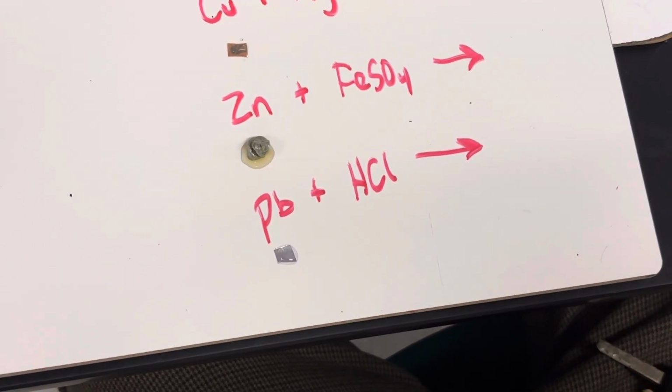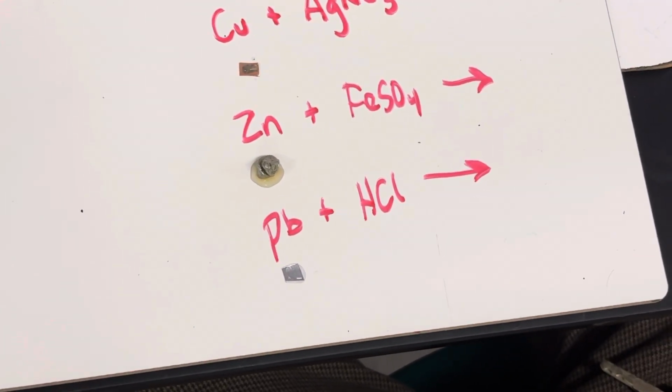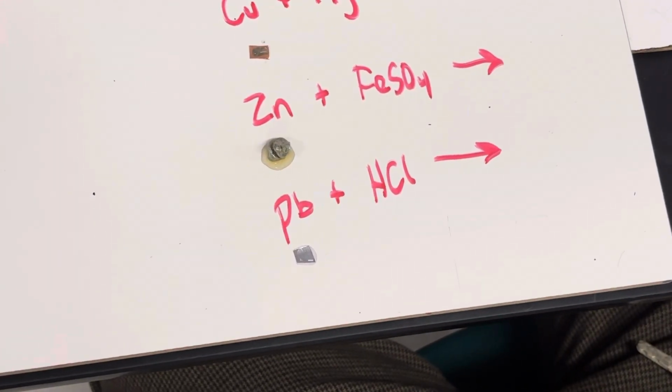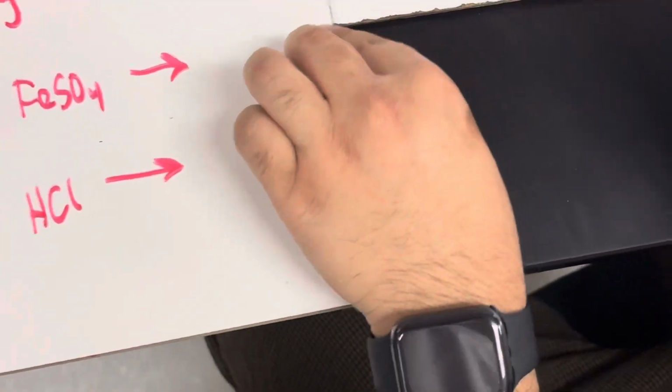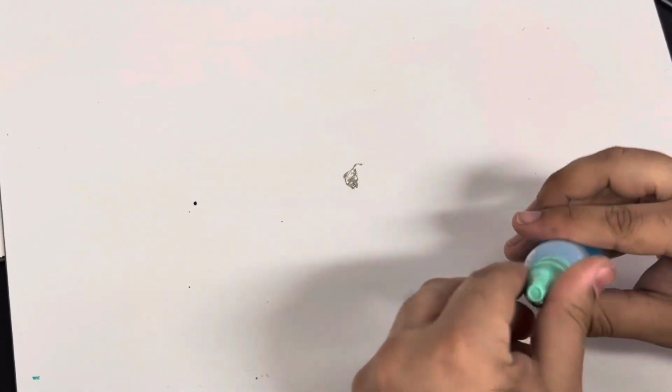And I think we'll do one more as we finish these up. What's a good one, Owen? Silver and magnesium. We did that one already. Oh, that was the first one we did. Oh, zinc. No, let's do a tin one. I like a tin. We'll do tin and copper. That's a fun one. Tin and copper(II) chloride. This is the last one we'll do.